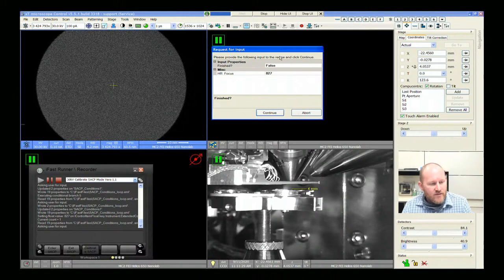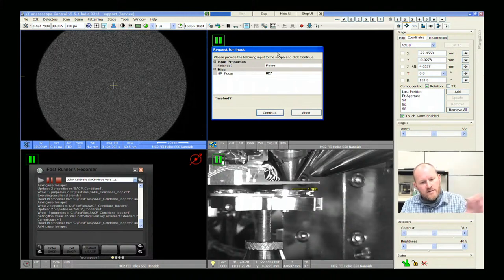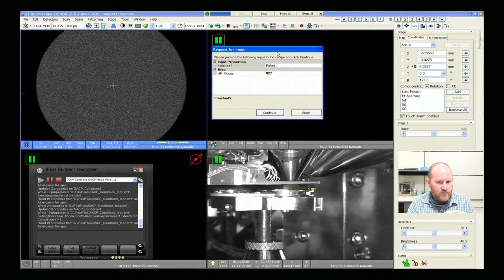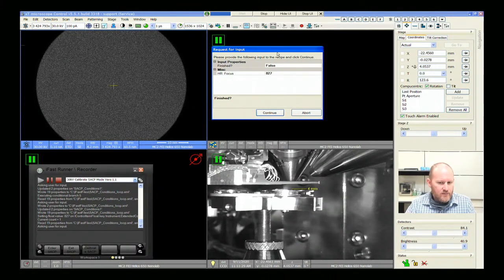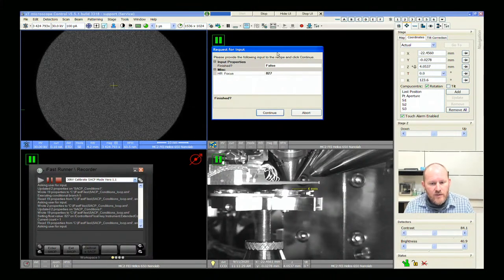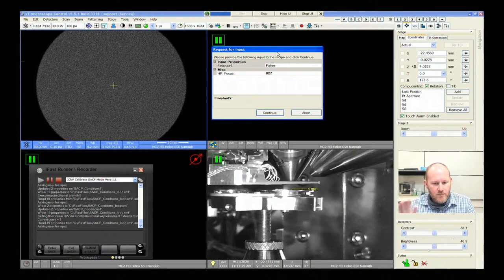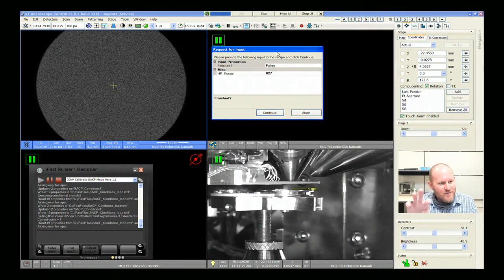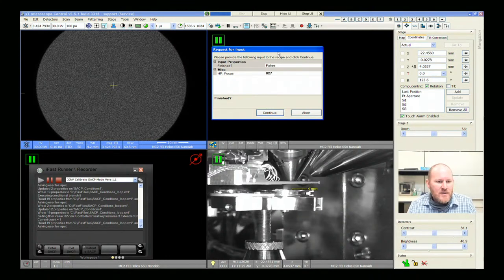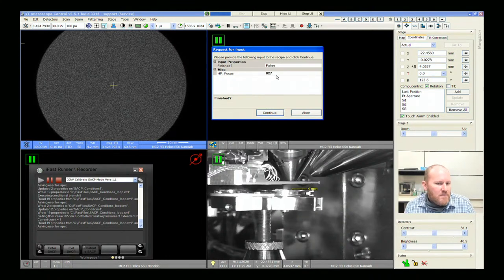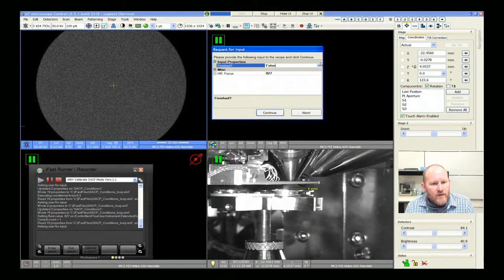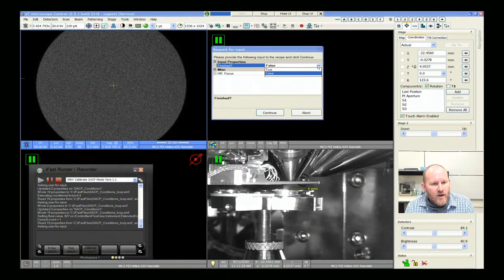The HR lens was one that wasn't quite right. HR focus value — I made a note that we want that to be 827. Now you see, as I changed that, the feature that was on screen has moved off screen, meaning that we're now back at the focal value or the rocking point. So I'm going to stop with that.